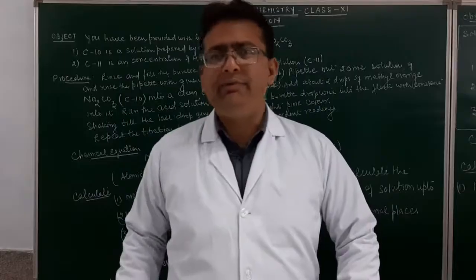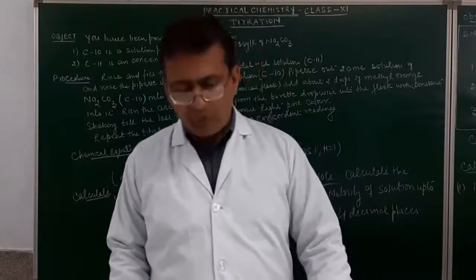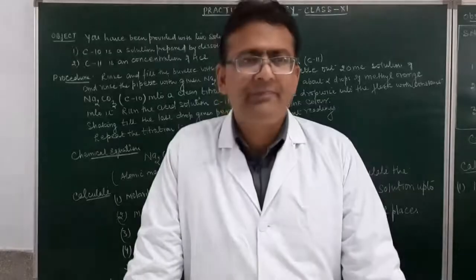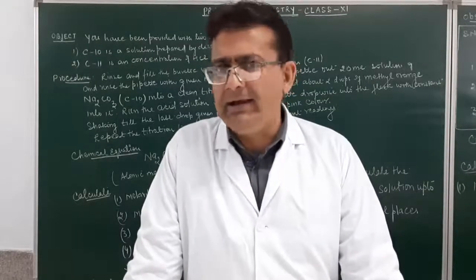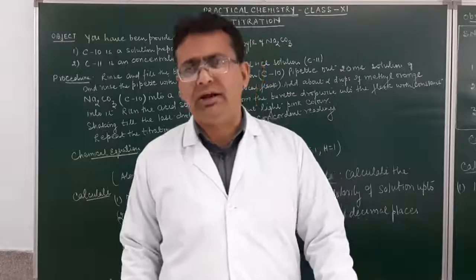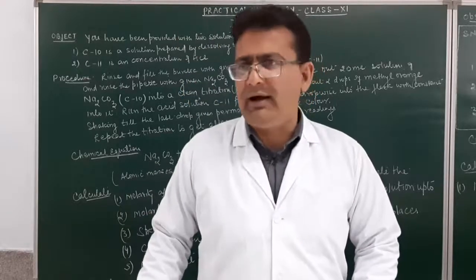Today I will be demonstrating to you the practical work of a titration in your syllabus. Students, in class 11th, we have to do the acid and alkali titrations. The concept of the acid and alkali titration, or what we mean by titration, was discussed with you in the chapter on chemical and ionic equilibria.